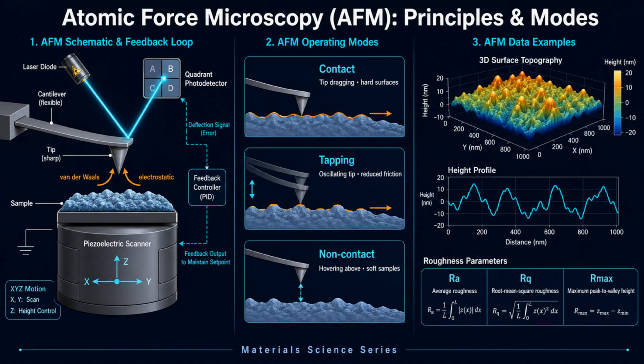There are 3 main operating modes. In contact mode, the tip drags across the surface maintaining constant force. This works well for hard surfaces, but can damage soft samples.